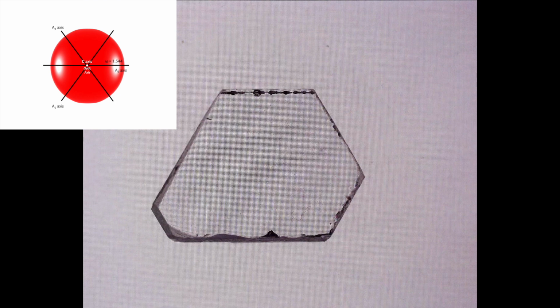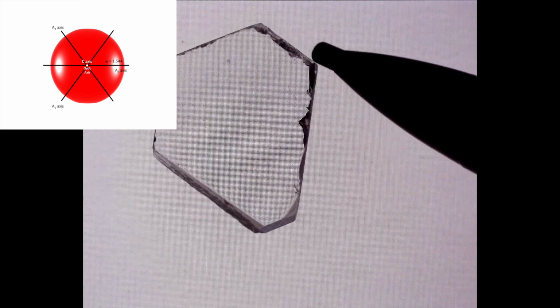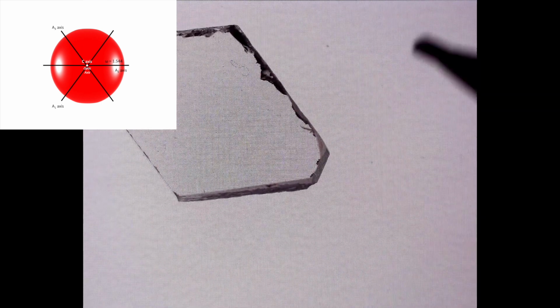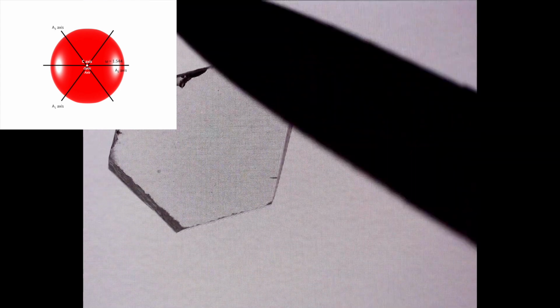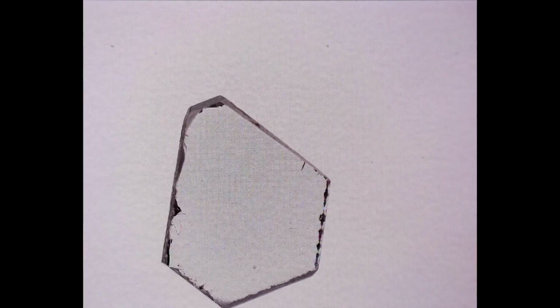So that's a change in color of our sample as we rotate it. However, given the orientation of our quartz, looking down the c-crystallographic axis, we shouldn't see any pleochroism as we rotate the sample, because our plane polarized light in this direction through our crystal is only interacting with refractive index omega. So our view along the c-crystallographic axis in plane polarized light is pretty boring.